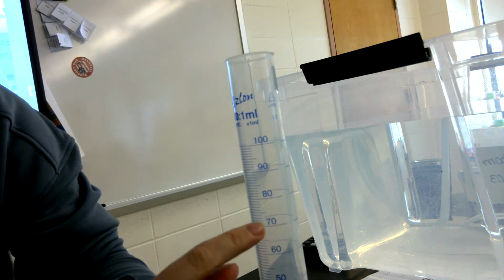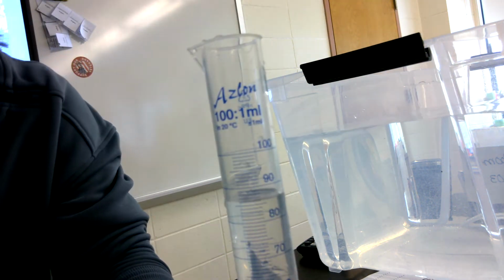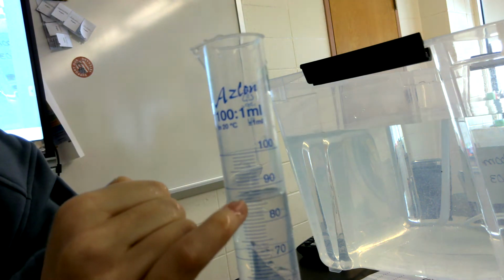Okay, so to measure a liquid, we use a graduated cylinder. So here's my graduated cylinder right here. And as you can see, we have our marks on each. For every 10, we have a larger number so we can read it. So to measure liquid, we would read these hash marks.